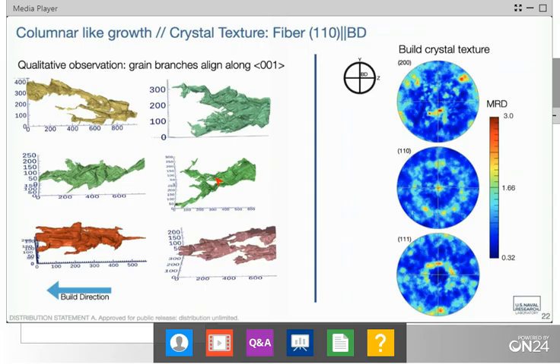Certainly there have been a number of papers that have shown that this is basically the overlapping of the weld beads and how these are the highest thermal gradients that exist within each layer. What is striking is how this has the ability to pass from layer to layer, even though these weld bead directions are changing. The other thing we can look at is the porosity, and I want to show why that's important in terms of how we look at grain features.